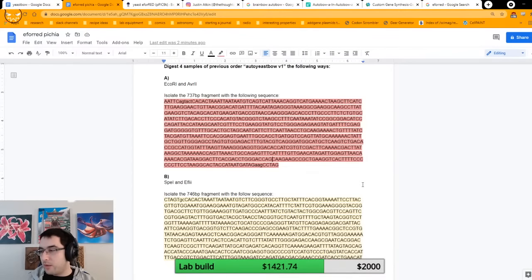It's not a matter of what I copy pasted and going back. I've made an error somewhere. But this is a perfect teaching opportunity of what can happen essentially. And this is why you have to quintuple check everything before you send it in. Because if I'd sent this in, I would have got something that doesn't match my file, and that's no good.